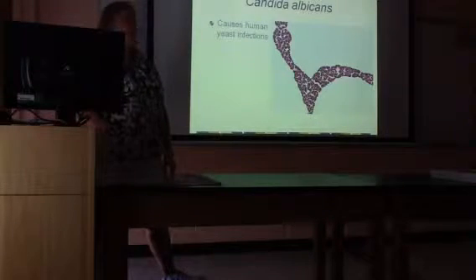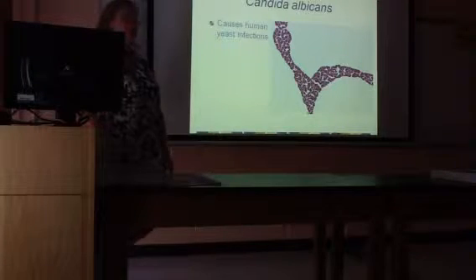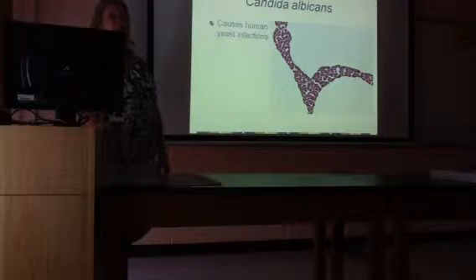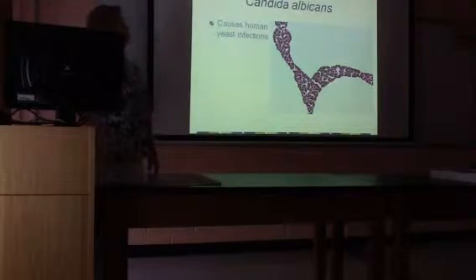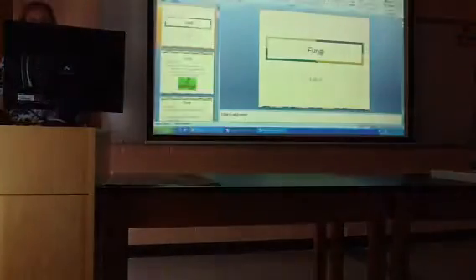I will do my best to make it as distinctive as I can if this gets put on a test. But they're both single-celled yeast. They look alike. It's just going to take practice. All right. So that is the end of Fungi Lab. Anybody have any questions before we move on to helminths?